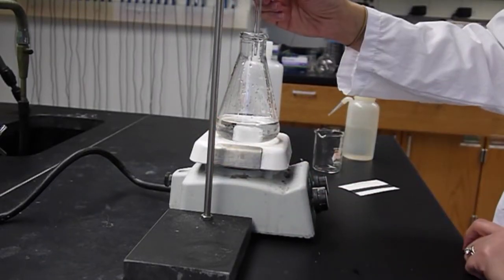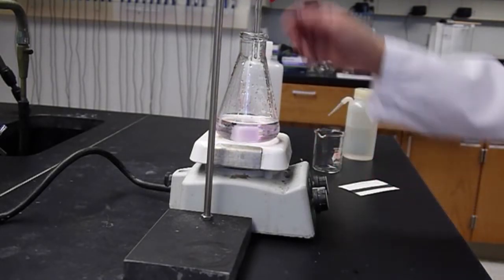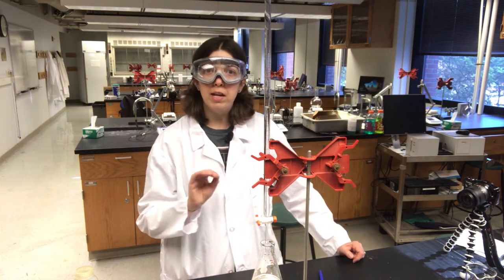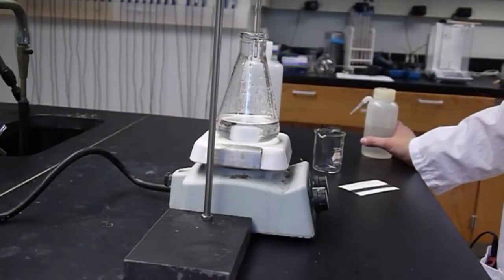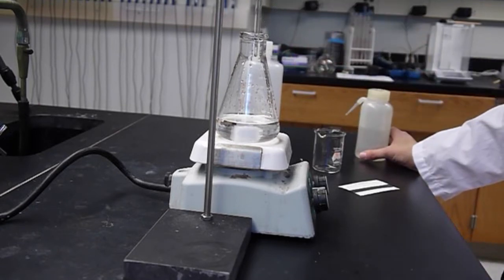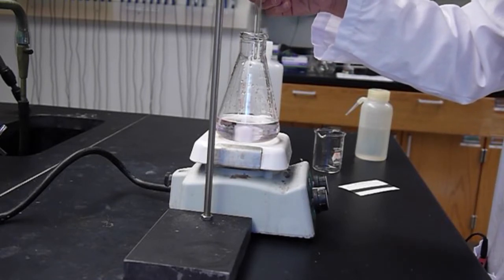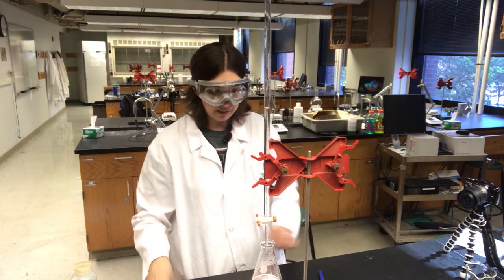I want to make sure we have a good, accurate endpoint. I believe we've reached the endpoint, or at least I'm very close. I'm going to add a half drop of sodium hydroxide — what we want to see is a faint pink color that persists for about 15 seconds. If it goes away before 15 seconds, you're probably not quite at the endpoint yet. I have a small bubble of sodium hydroxide on my burette tip, so I can spray the tip with water and add half a drop that way. There — this should be our endpoint.